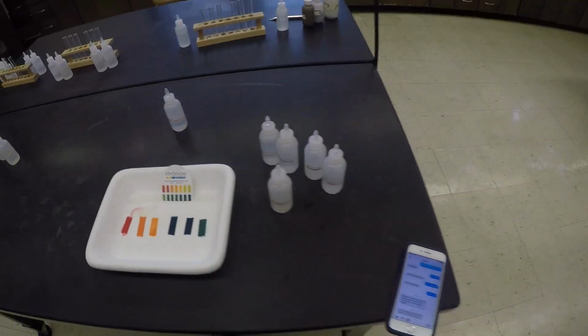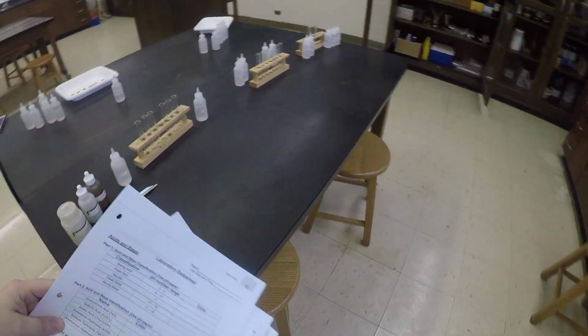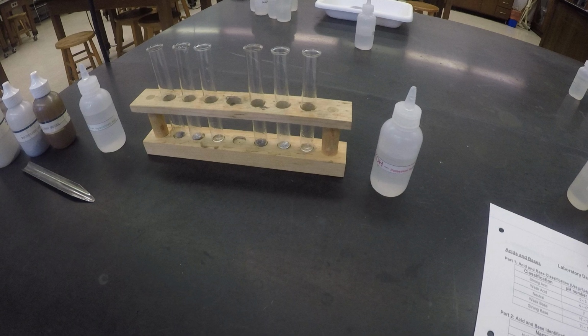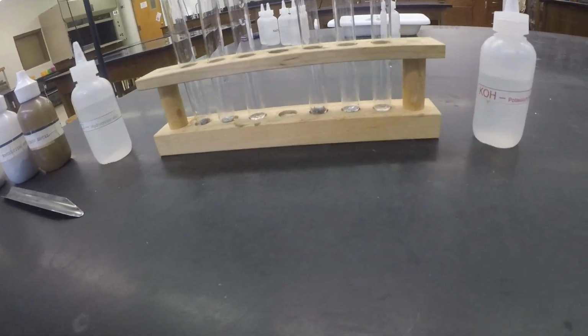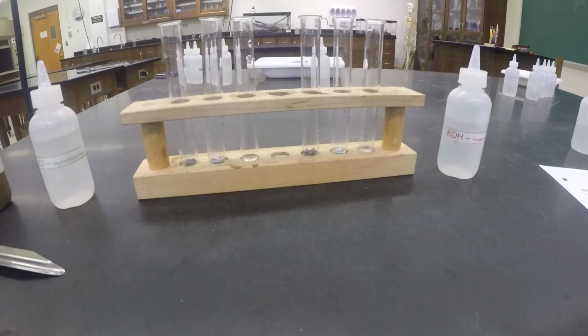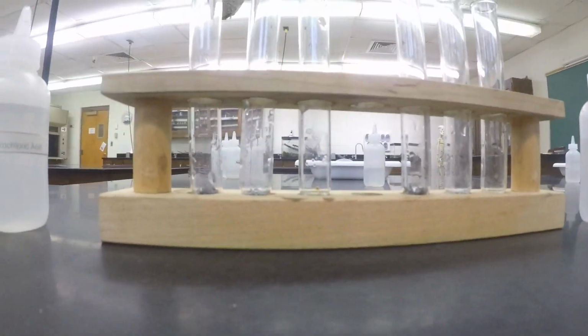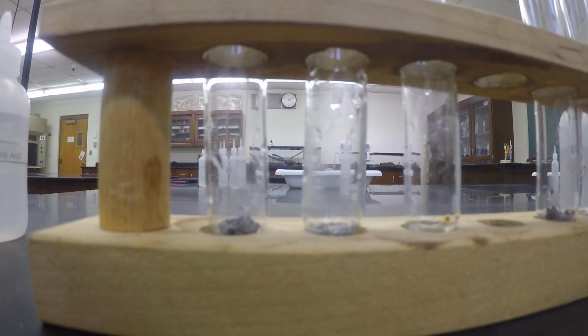Our next part, we're going to walk over here. Our next part is reaction with metals. Acids will react with certain metals. I'm going to show you, and I'm going to try to do the best I can with this. I've got 3 test tubes here.